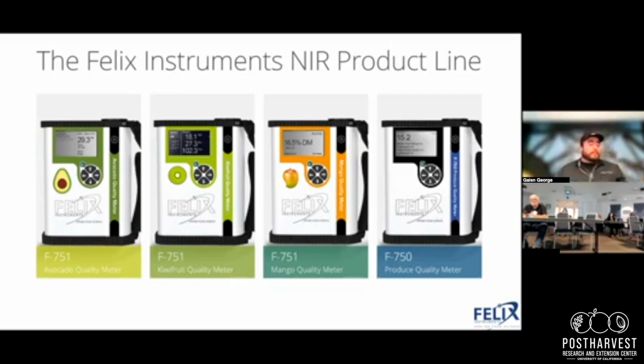Since we can see everything from, if we remember back to the electromagnetic spectrum, visible light, so 380-ish nanometers, all the way through about 1100 nanometers, we get the advantage of having both the color spectrum and the NIR spectrum, which can show us more information about actual chemical constituents. So we can look at simultaneously both color and dry matter and sugar, as well as a variety of other internal constituents. And the mango meter, we focus on dry matter and brix. So those are the two main parameters. We also have some users that look at internal color as well as external color in the mangoes.